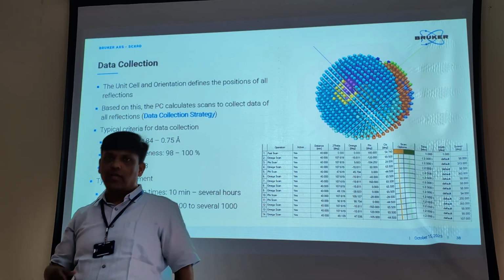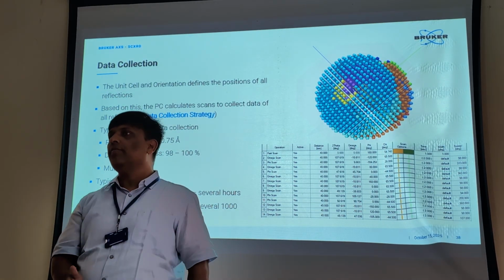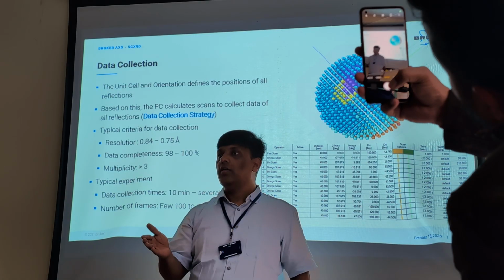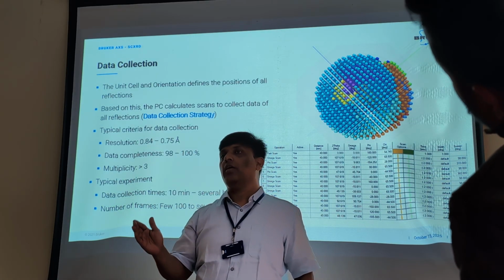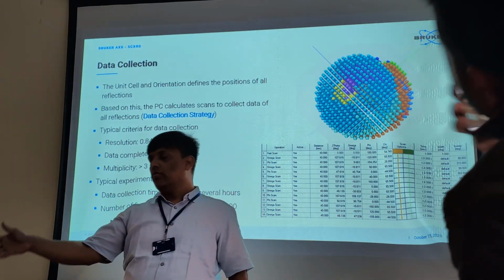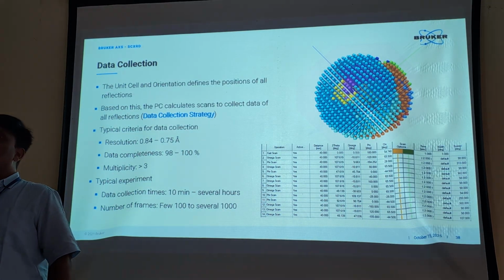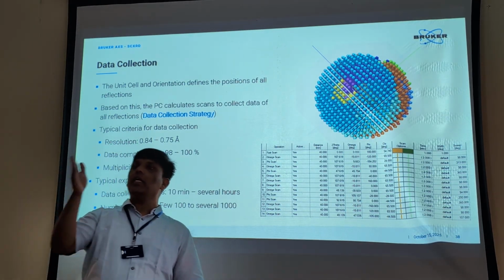Who will check this whenever you make your structure? To claim that it is a correct structure, it has to pass the test called IUCr checkCIF. Who is IUCr? It's the International Union of Crystallography. They have set an exam, so your structure file needs to be updated. Which is the file? The file is the CIF file, people call it checkCIF, which is independent of your structure.